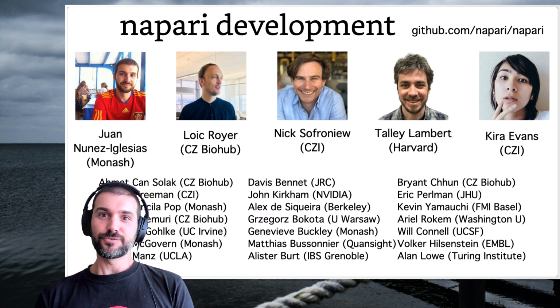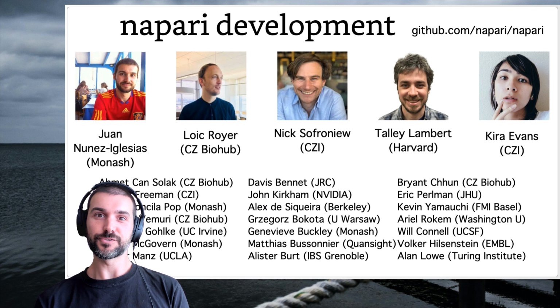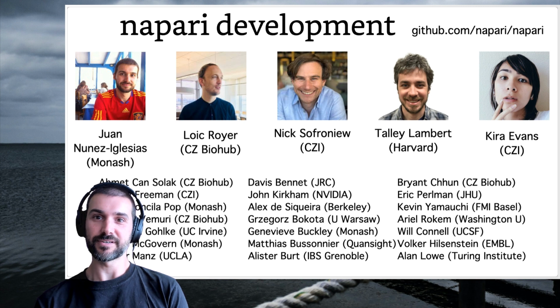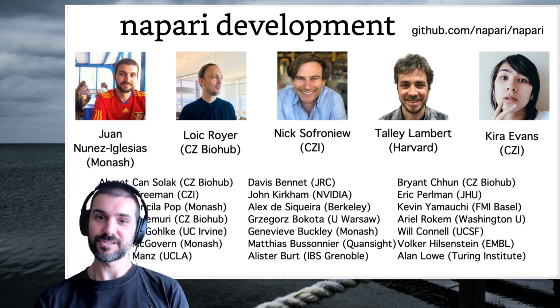Okay, so now on to how Napari is developed. Napari was open source from day one, so it was out in public even from the very first code commit. It was started by myself and Loic Royer at the Chan Zuckerberg BioHub, together with Kira Evans, who was an intern in Loic's lab. And then Nick Sofroniew and Talley Lambert joined a bit later, but they have contributed the bulk of the code now. They are both amazing. But you can see many more contributors under them.